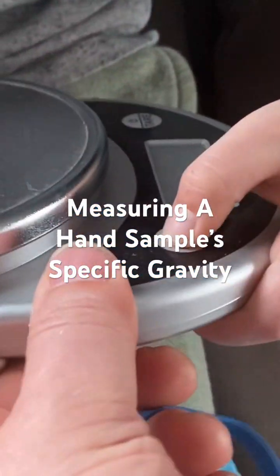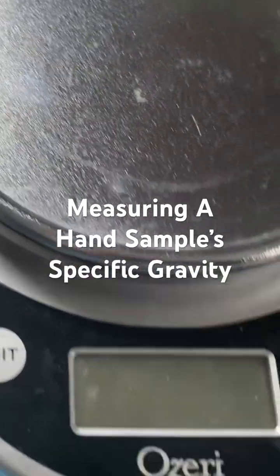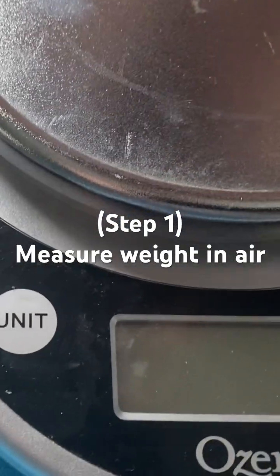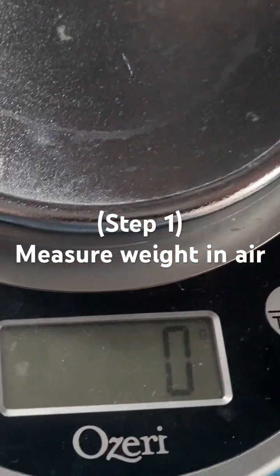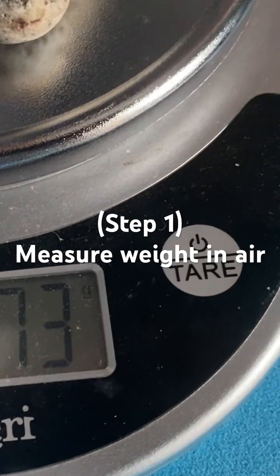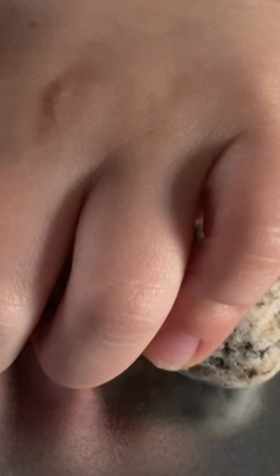This is a scale. We're gonna see how much this rock sample weighs. Go ahead, take your hands off for a second, drop it on — okay, place it on there. We're in grams. 173 grams. Now we're gonna weigh it in water.